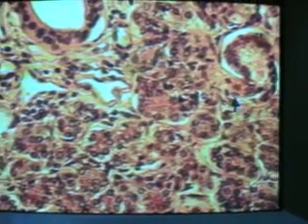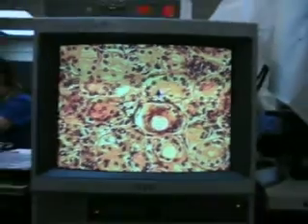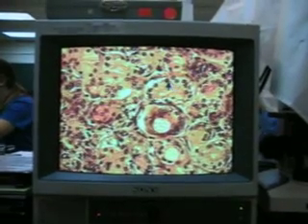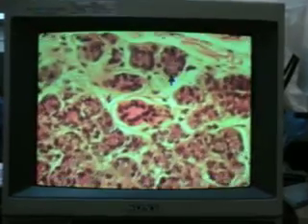and maybe not. I thought that they look better at a lower magnification, but I'm not sure. You see these are really nice now. You can see these really pretty. Even though they're pulled away, clearly these are different kinds of cells, and these are mucus secreting cells, and that's what you'll look for in the submandibular gland.